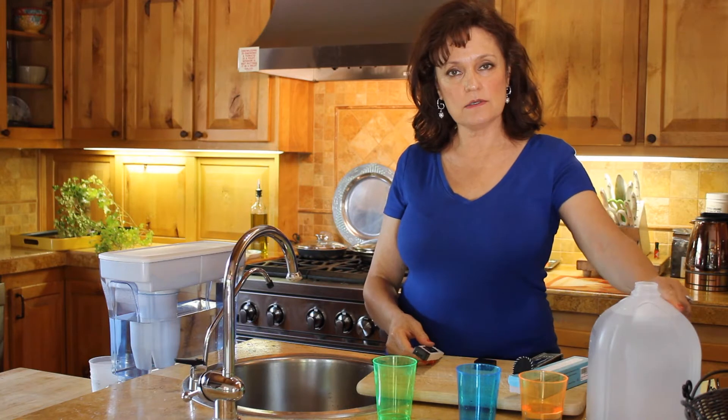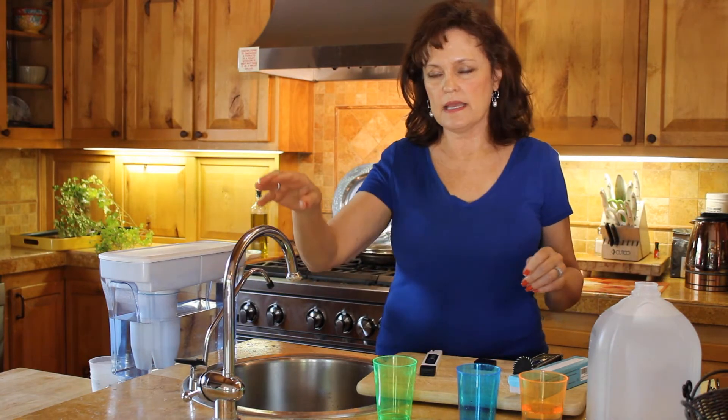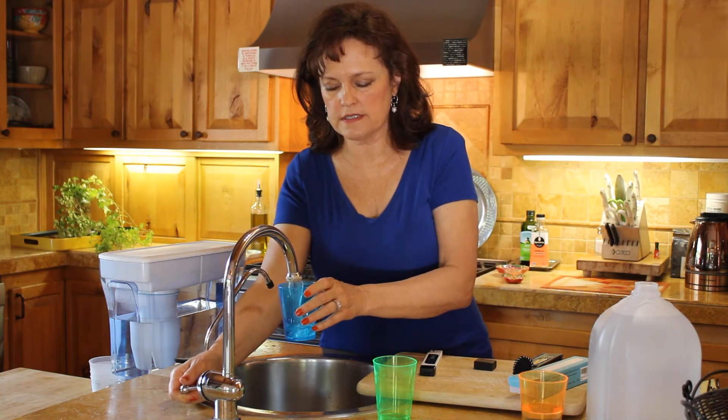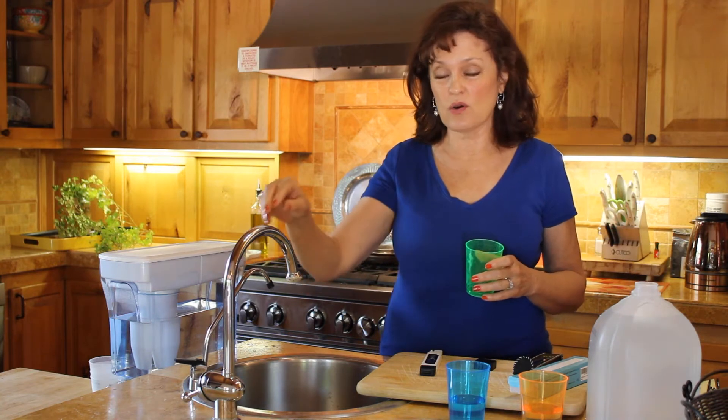We're going to look at distilled water today, reverse osmosis water, and tap water. Water is the first thing that Dr. McDaniel would teach to all of his patients — what type of water are you drinking? Are you consuming distilled water, reverse osmosis, or even tap water, which is not great.